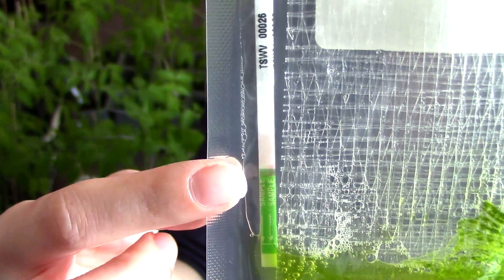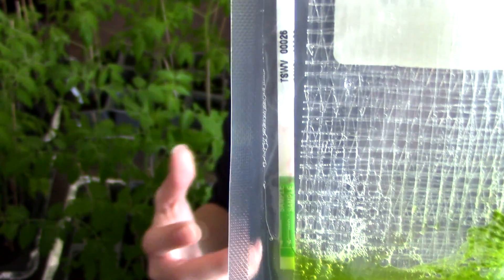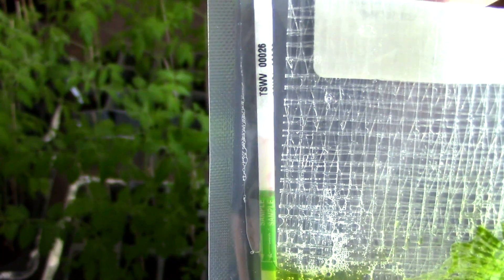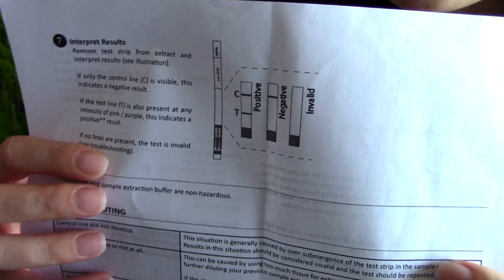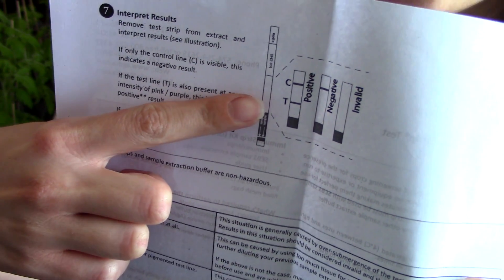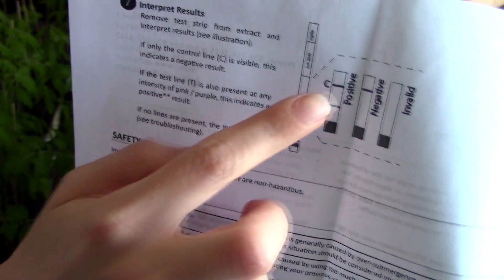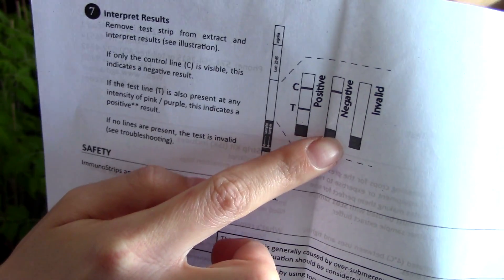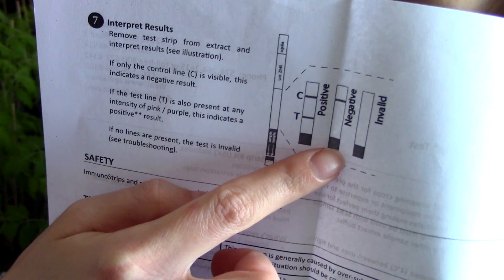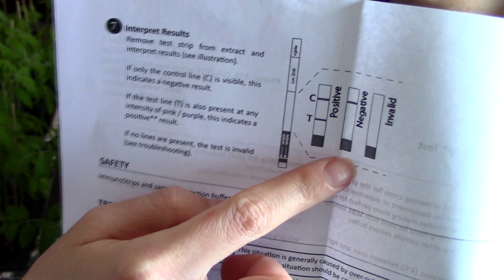You can already see the fluid starting to go up the test strip. We need to wait a few minutes until the control line appears so we can read the test. Looking at the instructions: a positive test should have two stripes, indicating the plant is infected with a virus. If the plant is not infected, you will have only one line — the control line — which tells you the test is valid and worked, but your plant is not infected with any virus.